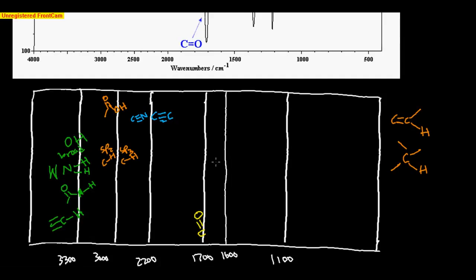And let's go to 1600. Just to the left is where you will find your alkenes, and the more intense is usually your nitrogen double bonded to the carbon. Usually right on 1600 or pretty close to right on it, you will find your peak for an aromatic ring.